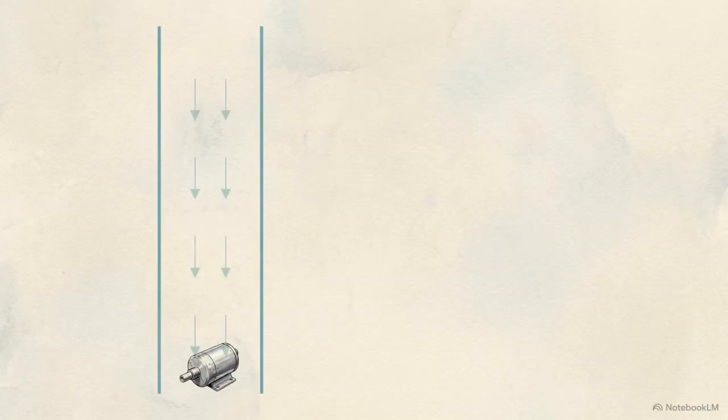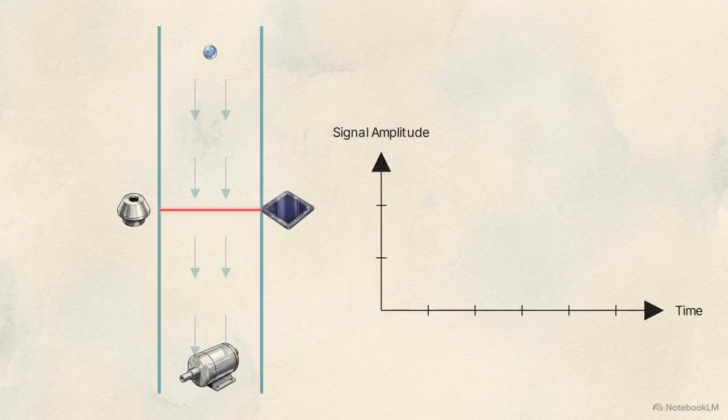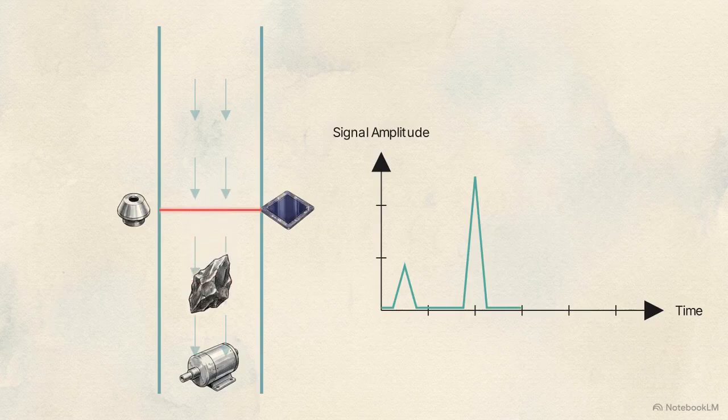This cross-section diagram shows the core mechanism inside a particle counter. A vacuum pump continuously draws a controlled sample of air into a central chamber, directly across a high-intensity laser beam. When a physical particle hits that laser, it scatters the light outward toward a photodetector plate. A tiny particle passing through the beam produces a very faint flash. The detector instantly converts that dim light into a short electrical pulse on the output graph.